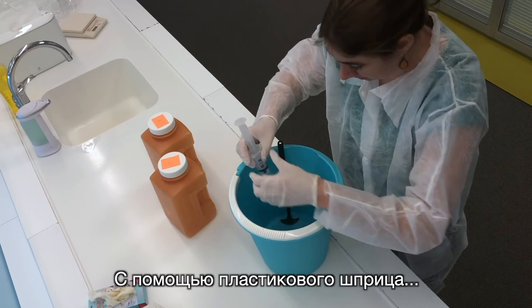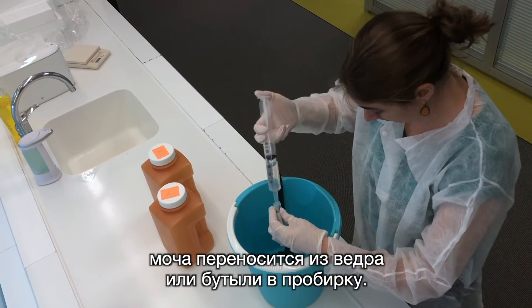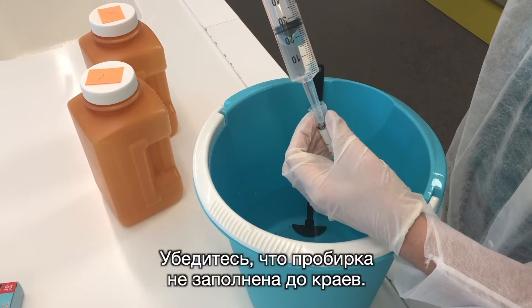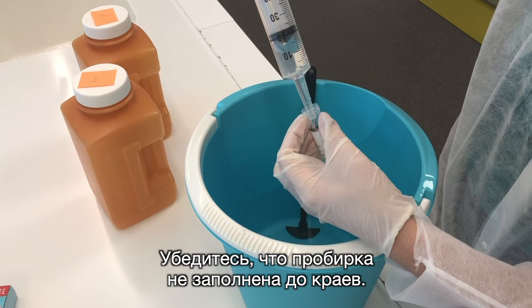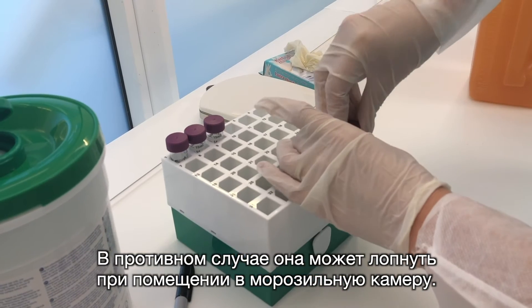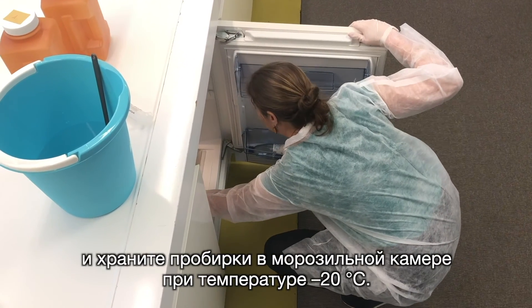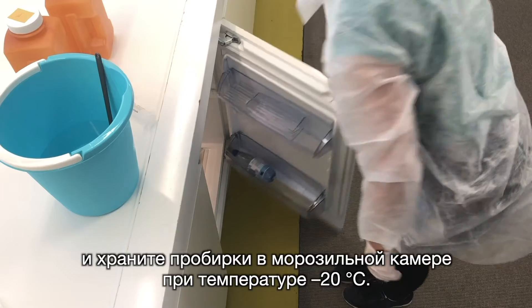The urine is removed from the bucket or bottle using the plastic syringe and transferred to a test tube. Make sure that the test tube is not filled to the brim, otherwise it might break when stored in the freezer. Close the test tube with a screw cap and store the test tubes in a freezer at minus 20 degrees Celsius.